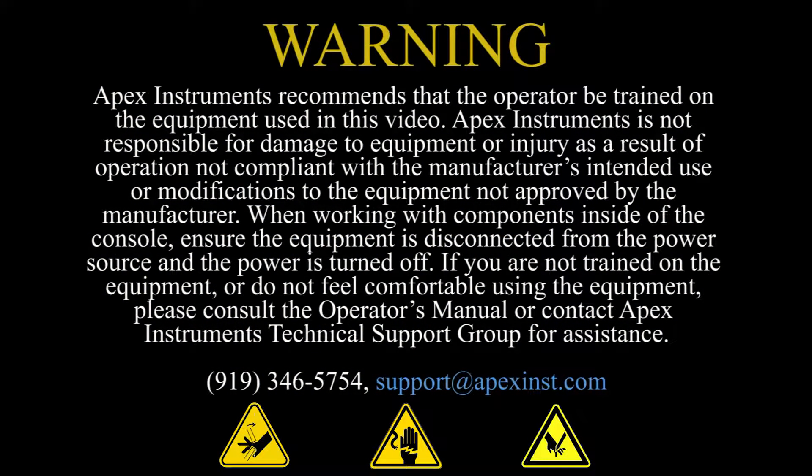Apex Instruments encourages you to use or perform any maintenance on this equipment safely. In this video, we may show an icon that conveys a safety hazard or risk that is associated with the operations performed. Be mindful of inherent hazards such as pinch points, sharp objects, or shock injuries.